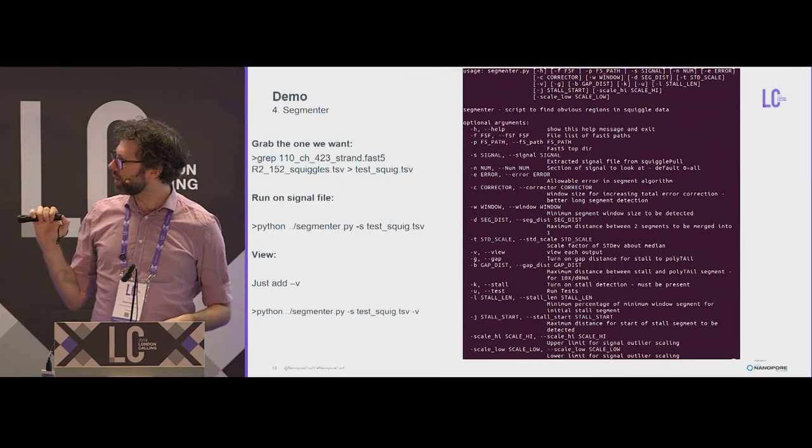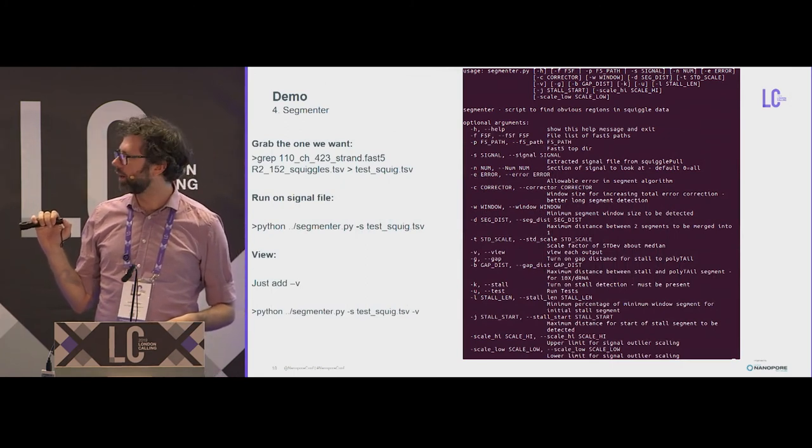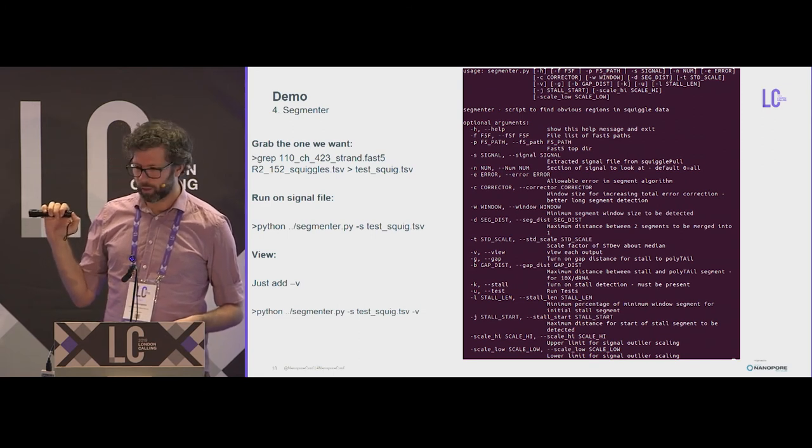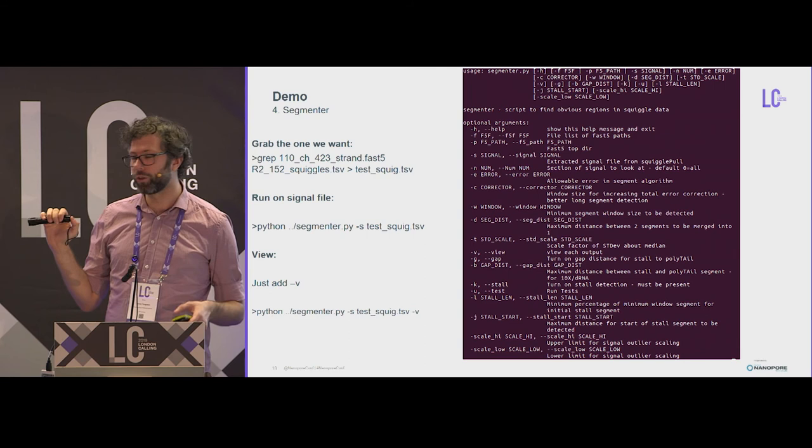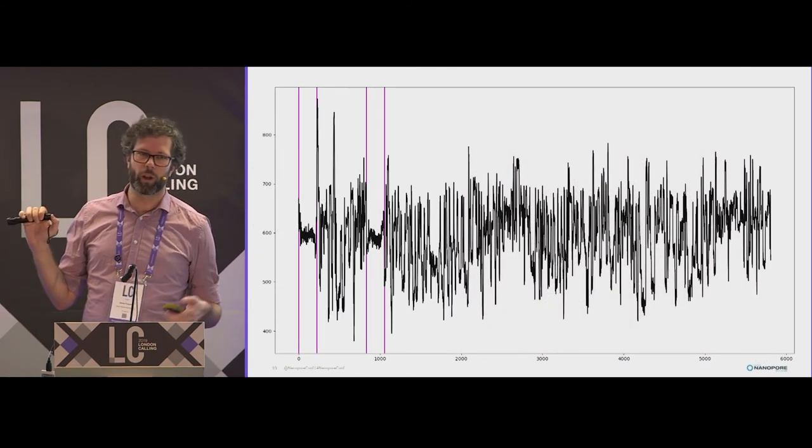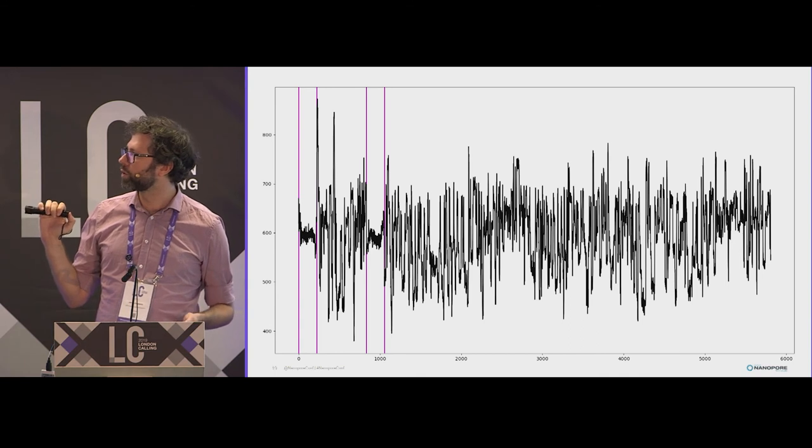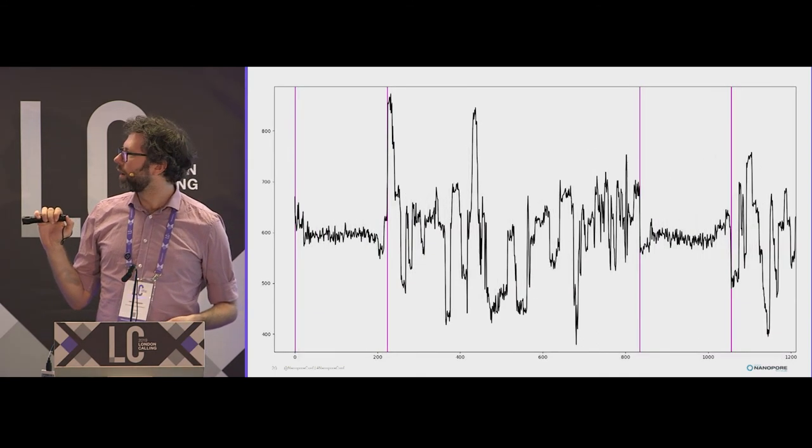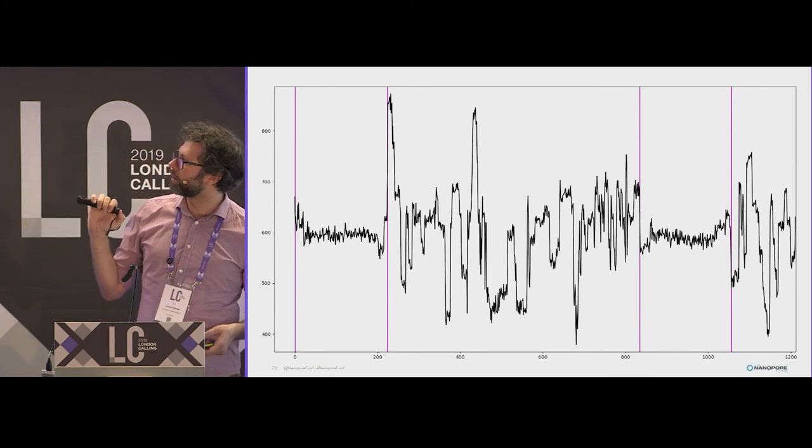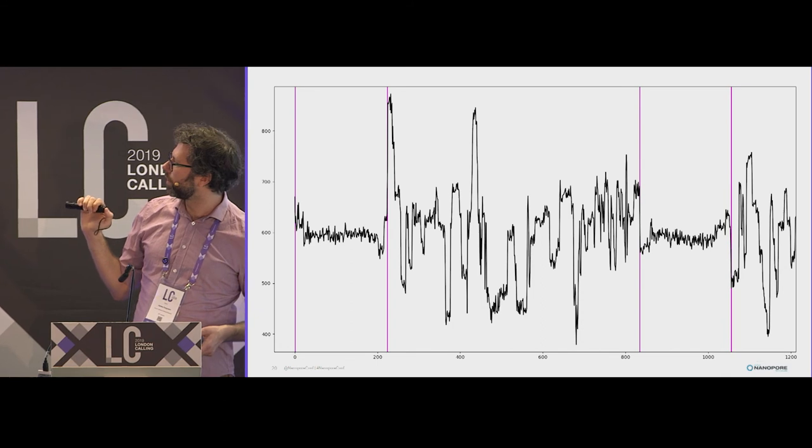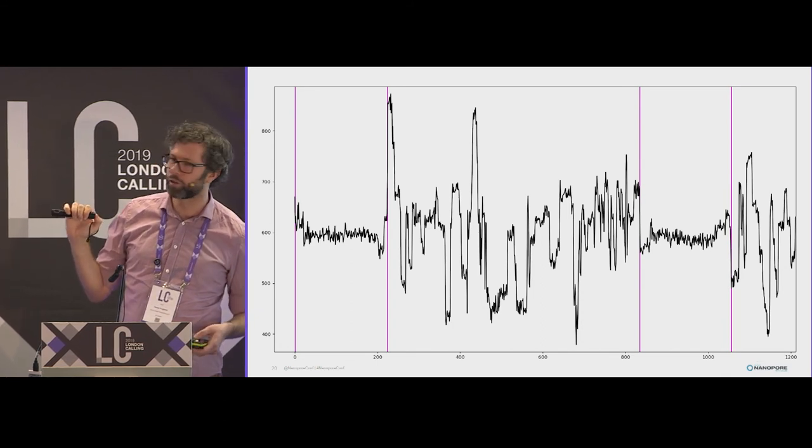Segmenter. Segmenter is a little bit more complicated to find these. There's quite a lot of different variables you can use to tune everything. And you can visualize each one of these. You can run it on thousands of files, or you can visualize them. You can see how it finds these two regions. Zooming in, you can see the accuracy of the cuts. We can see it cuts right on these regions of where the homopolymer stretches are, or the stall.